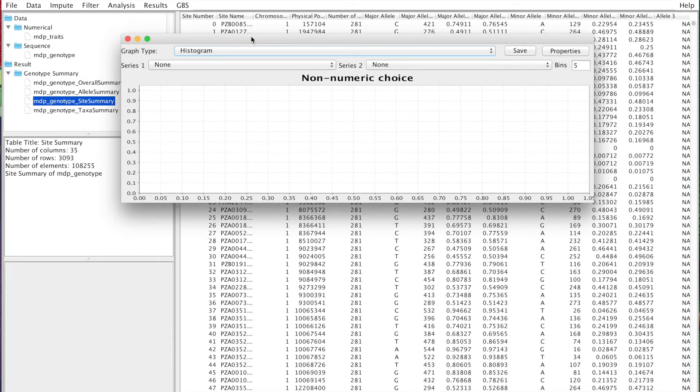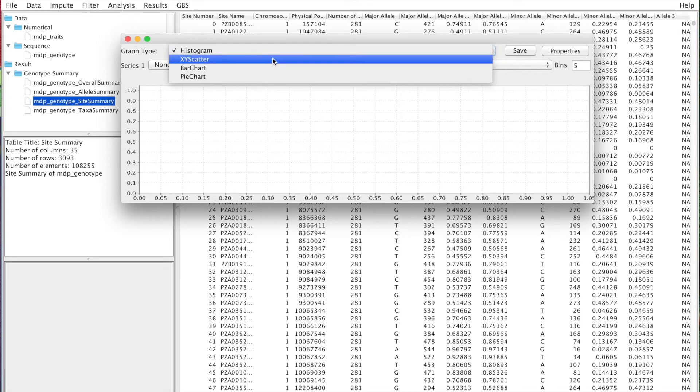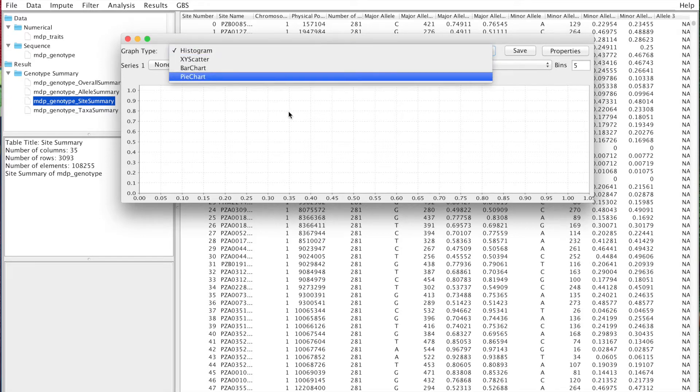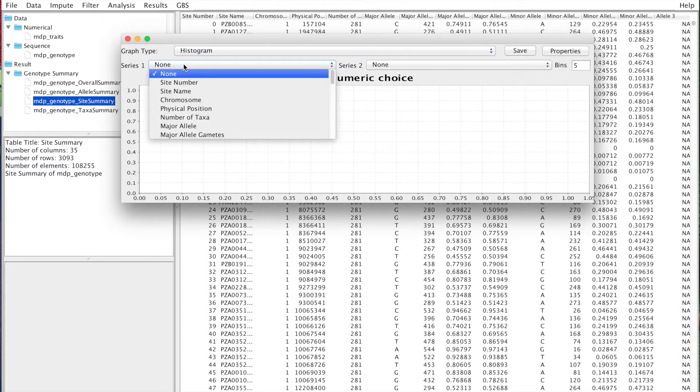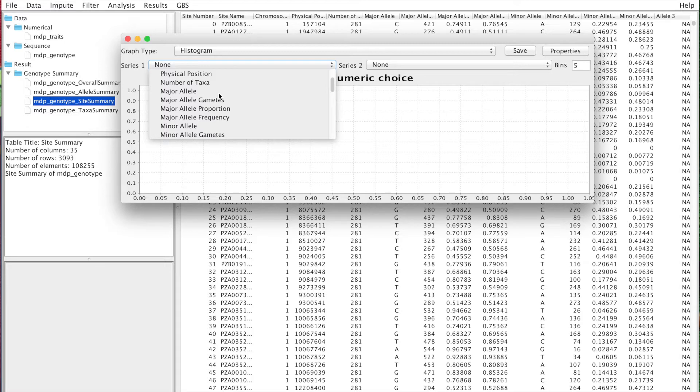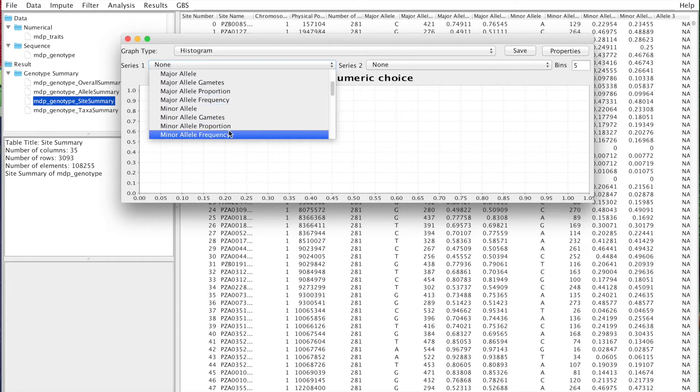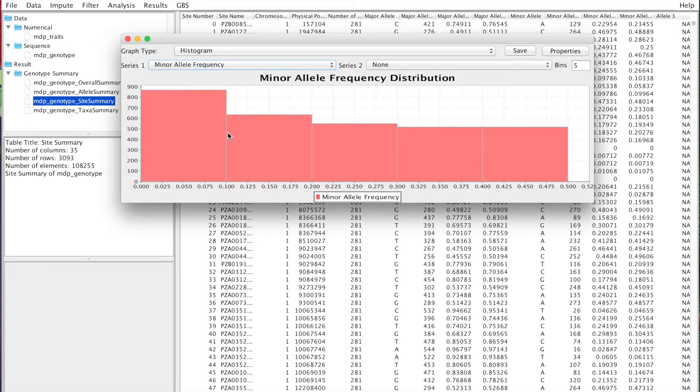This is what's going to be really useful for knowing which filtering parameters we're going to use. You can also do scatter plots and bar charts. Let's start with just a histogram. Let's look at one of the important things: minor allele frequency.